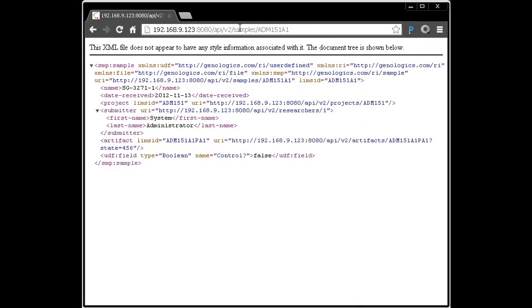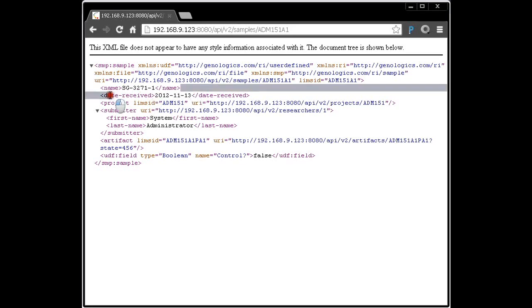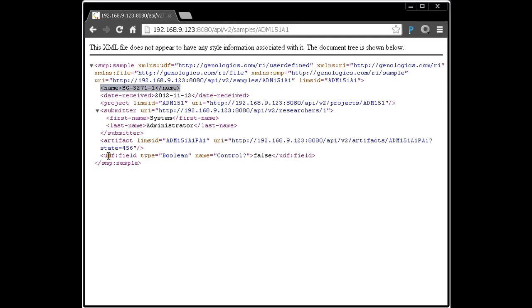Now we're seeing the XML representation of that sample in the web browser. We see, for example, its name, when it was received, who submitted it. And if we have any user-defined fields, they also will be listed. So that's what a sample looks like as far as the API is concerned in the LIMS.